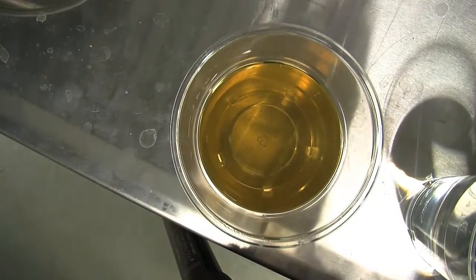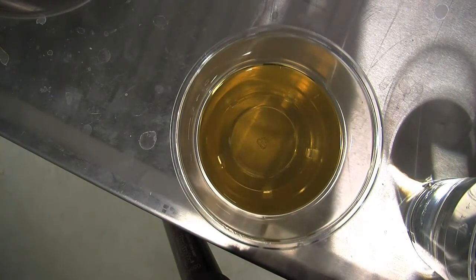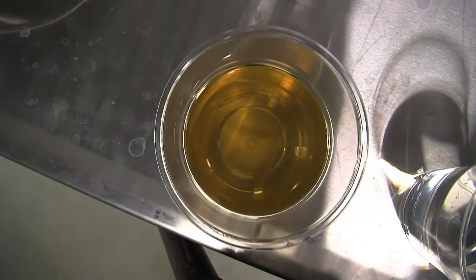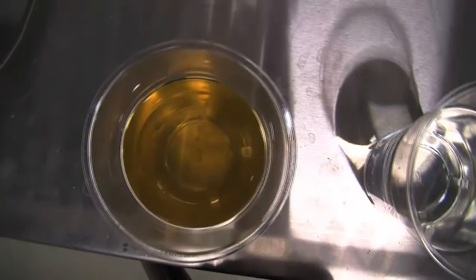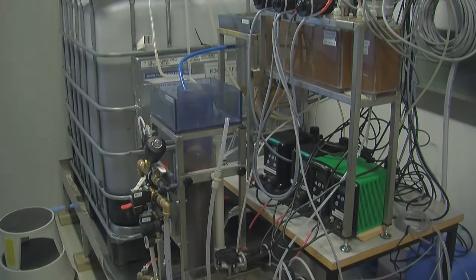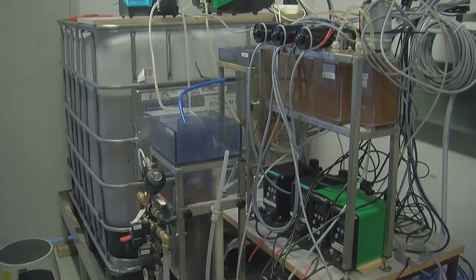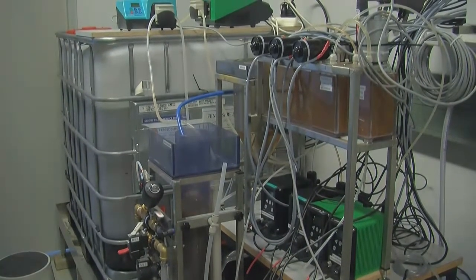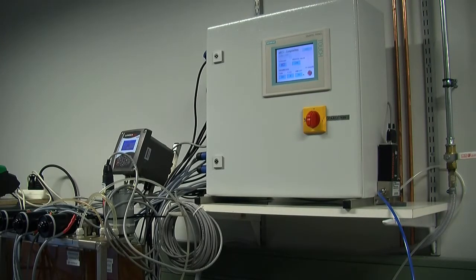Here we have before us 2 glasses of water. On the left, a glass of water drawn directly from Kurun River, from which the city of Vasa takes its raw water. On the right, a glass of water that has been treated with our benchtop scale Waterworks here at our laboratory at the Vasa University of Applied Sciences. The apparatus is fully automated by using PLC control and handles the following unit operations and processes.